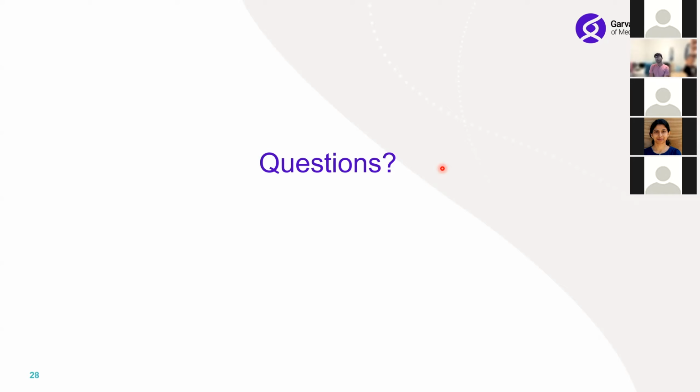Yeah, so the idea was to use this real-time capability of the sequencer. It will keep producing data, but if you could process it in real time, then you don't really need to store that big amount of data. You can directly go to the final result at the end of the sequencing run.